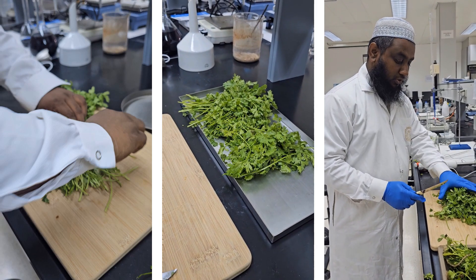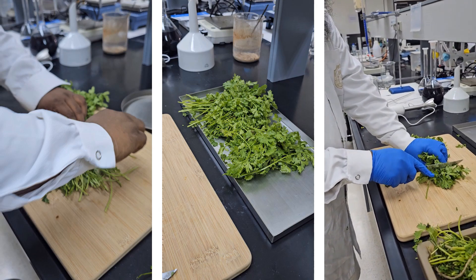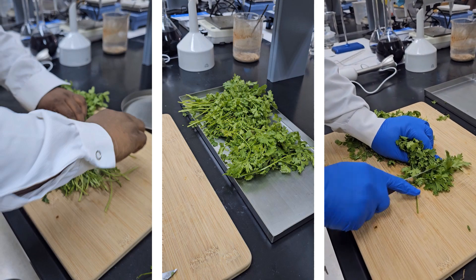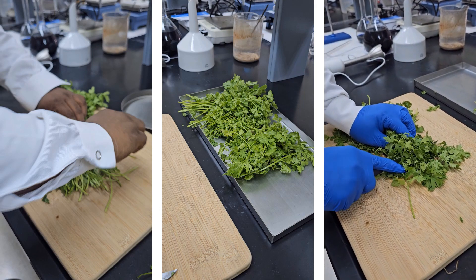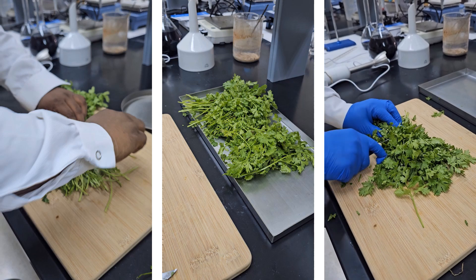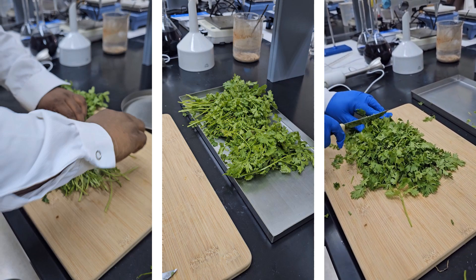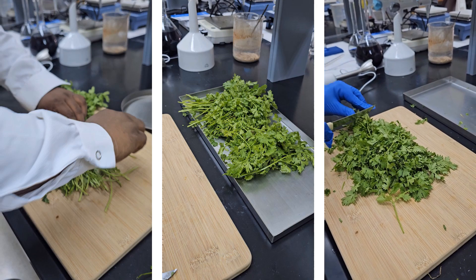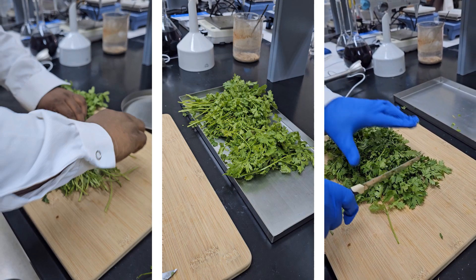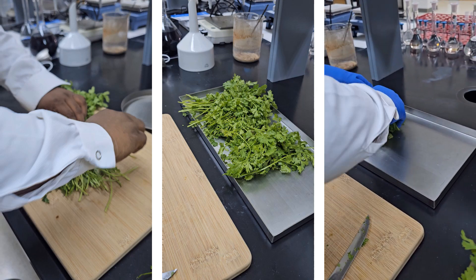After sorting out the damaged parts, now I am going to chop the coriander leaves and transfer them into the freeze-drying tray.